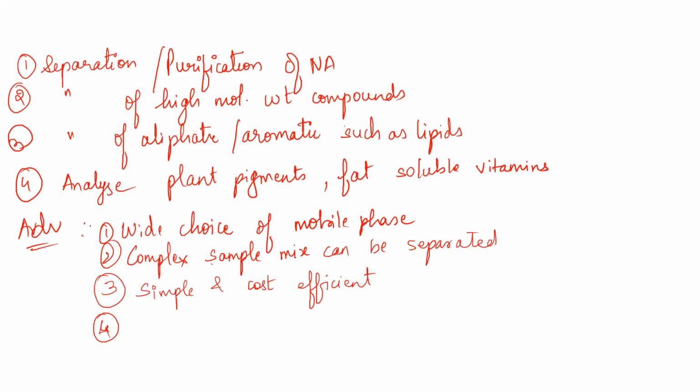How was it manufactured, how are they packaging it? We pay for everything, we don't pay for just one process. So this step is also important. But here the detection and separation is simple and cost effective. Manual and automation, both can be done. Automated adsorption chromatographies are also available. You can even do it manually.